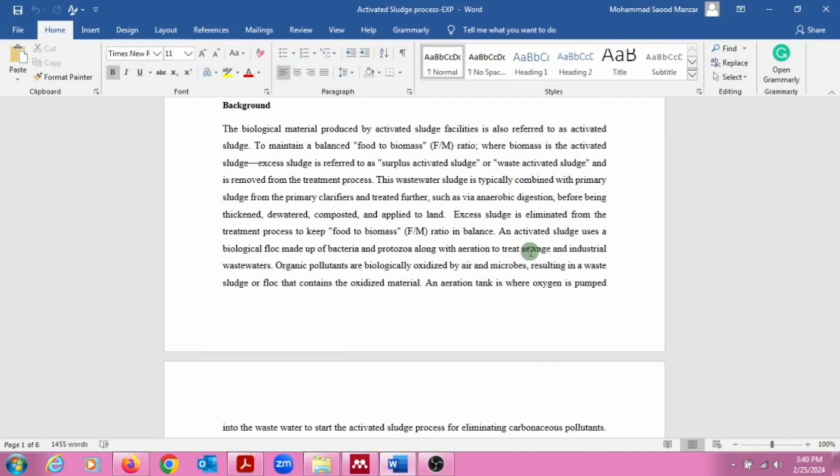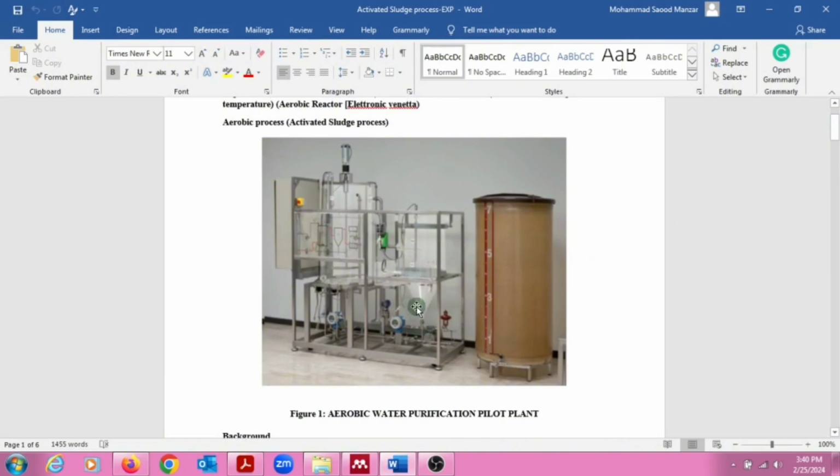The resulting mixture, composed of treated sewage plus the activated sludge coming from the aeration tank, passes into the settling tank, in which the treated sewage, which is on the surface, is separated from the sludge by gravity. Here the sludge is separated by gravity, in a tapered shape, and eventually settles at the bottom here.